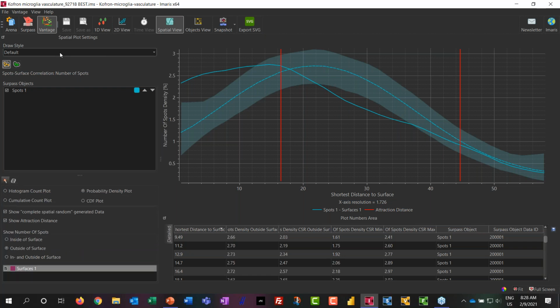Okay. So hopefully that gives everyone a good introduction to these plots. The intensity plots are pretty similar, and the overlap information, or the overlap statistic, is straightforward under that statistics tab.